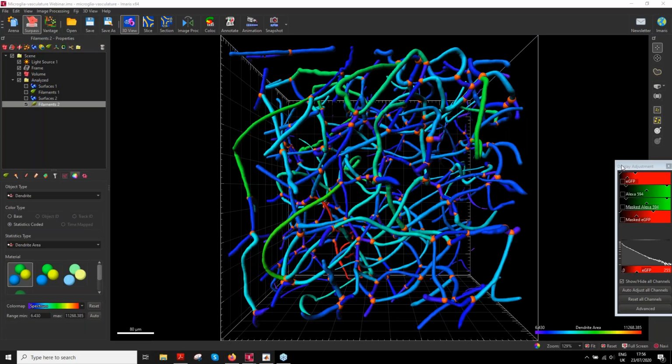Okay. And we had a few questions come in, and we actually had a couple of people asking something pretty similar. So Orly and Mike were both wanting a fuller explanation of seed points. What exactly are they, and what are they doing? Could you go into that a little bit more and talk about seed points?